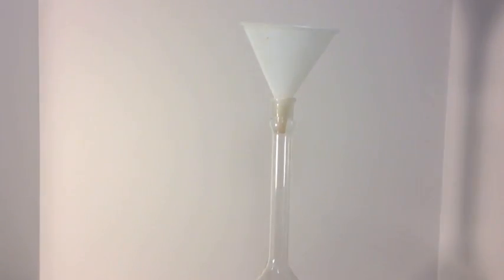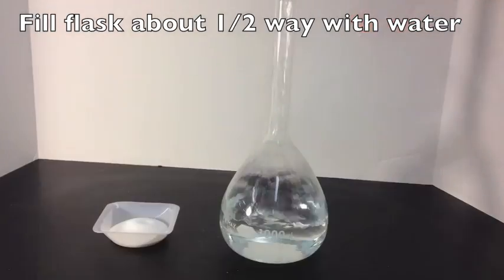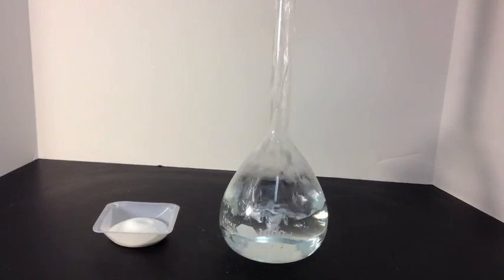Then you fill the flask about halfway with water. This is a one liter flask, a thousand milliliters. Fill it up about halfway, just enough water to get all of the salt dissolved.